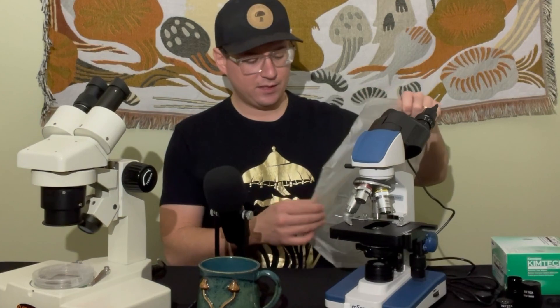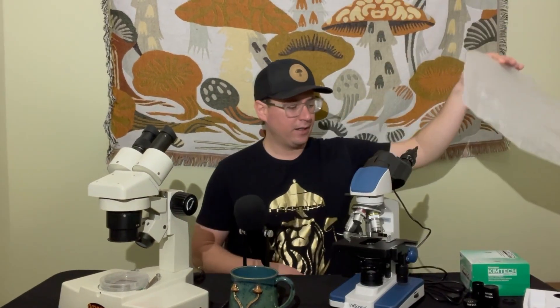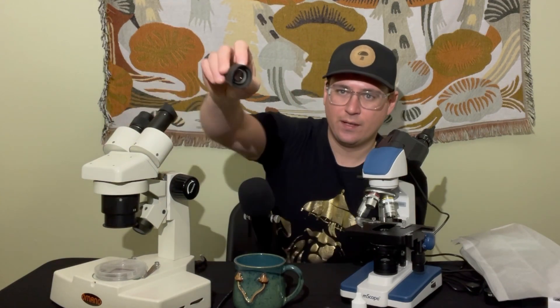The first maintenance procedure you should always follow is proper storage. Most microscopes come with a little plastic bag or dust-resistant cover, and the purpose of that is to prevent dust from getting into the ocular lens. This is a microscope I borrowed from my friend Zach — it comes with a beautiful case but looks like it was slightly neglected. I'll show you how to clean the objectives and store it properly for next time.